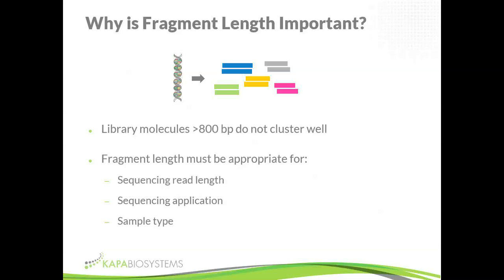On the other hand, if you're doing clinical applications, for instance, sometimes there are cases where the first read and the second read are used to confirm the sequence, and then it's better to have a library fragment length around 150 base pairs, so that you can read through the entire sequence from both ends and get a 100% overlap.